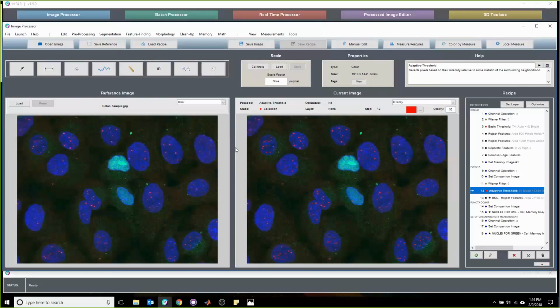I don't think we have time to go into a full demonstration of another 3D reconstruction. I did show what the finished product of a 3D reconstruction looked like for bright gamma prime particles, and certainly pores are even easier. You could just imagine inverting that 3D data set, and now your particles are black and they're just like pores, and we would come up with a recipe for the pore detection. We would batch that on all of the slices, in the same batch process assemble the data set into a 3D file, open that 3D file in the 3D toolbox, slide through it, spin it around, maybe do some artifact removal directly in 3D.